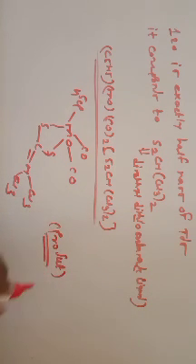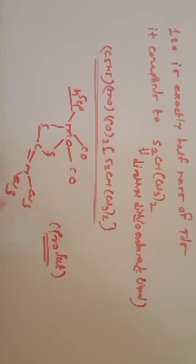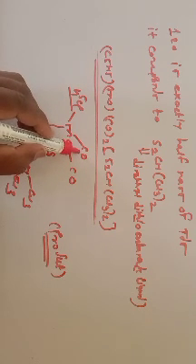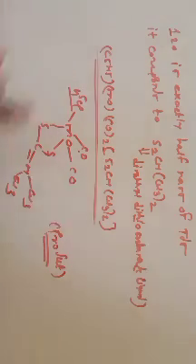So with the help of H1 NMR spectroscopy, we identify that there is one eta 5 Cp present and two methyl groups originating from the TDS. Then IR information gives that there are two carbonyls present, and these are terminal carbonyls. And the last one, the mass spectrum, is very useful for solving this problem.